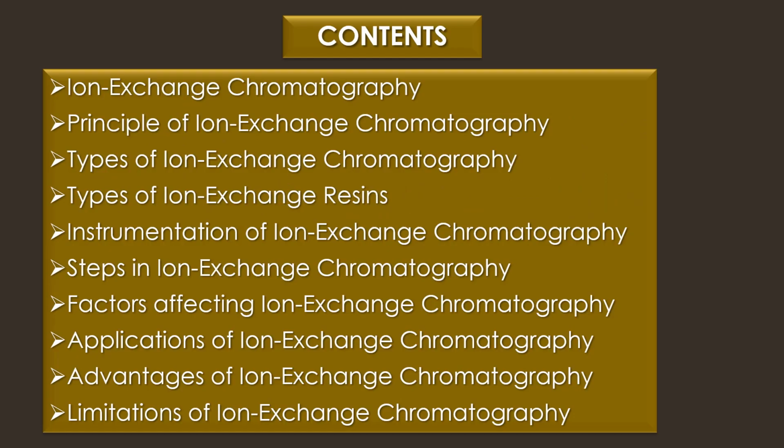The contents of this video include introduction about ion exchange chromatography, principle of ion exchange chromatography, types of ion exchange chromatography, types of ion exchange resins, instrumentation of ion exchange chromatography, steps in ion exchange chromatography, factors affecting ion exchange chromatography, applications of ion exchange chromatography, advantages of ion exchange chromatography, and finally, limitations of ion exchange chromatography.